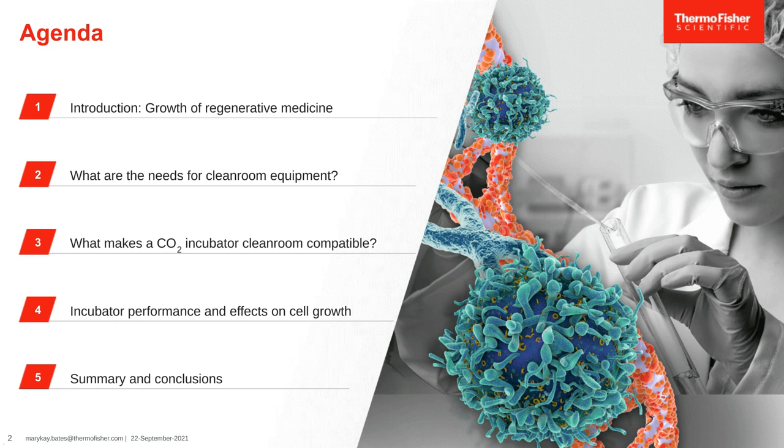I'll begin with an introduction, just reviewing the global growth of regenerative medicine. It's fun to look at the excitement in this sector. Then I'll talk about what are the needs for clean room equipment. And that involves not just documentation, but also cleaning and disinfection. What are the concerns for working in a clean room, and how is that different from an R&D lab?